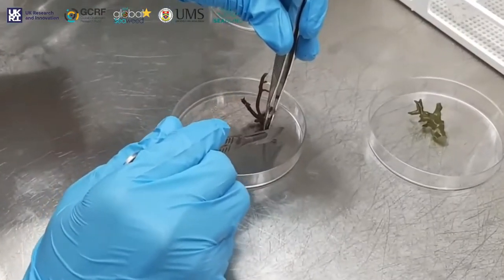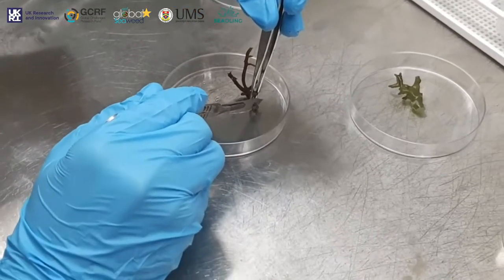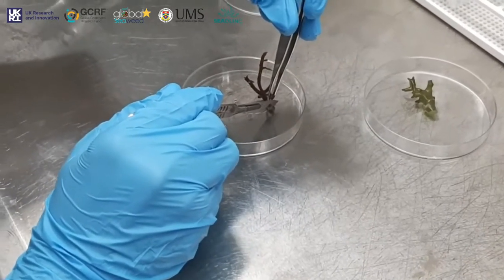They were sterilized, the pathogens were discarded, and the seaweeds were then subjected to enzymatic treatment for the release of protoplasts.